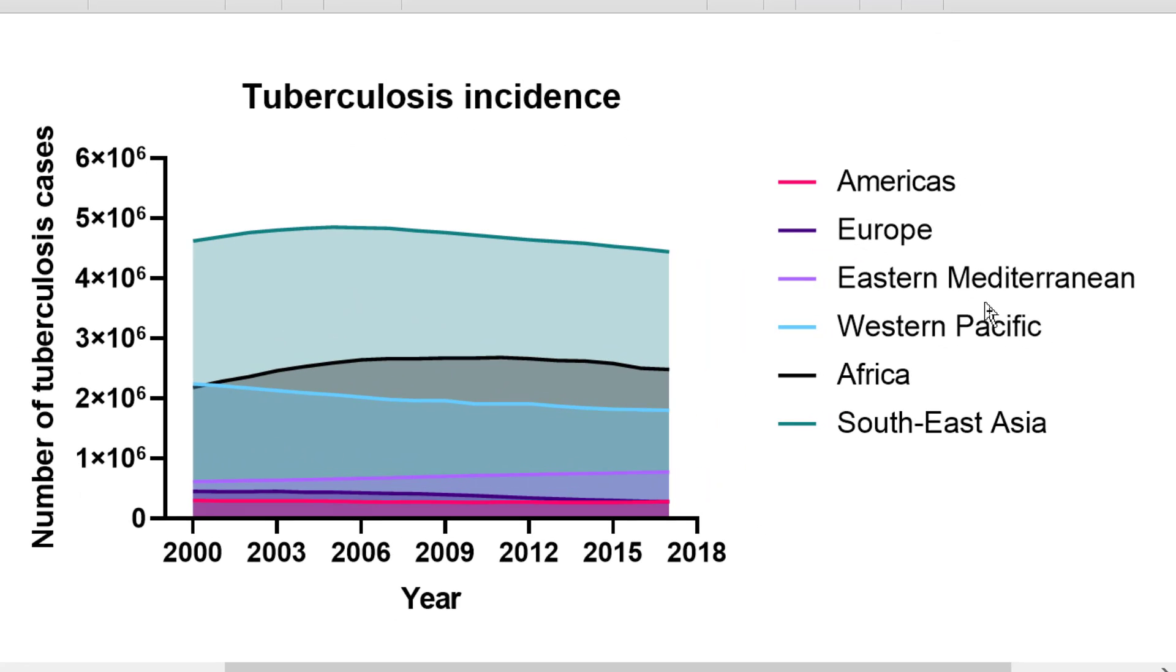So in this video tutorial, you've learnt about creating an area graph in PRISM. You understand that an area graph is a variation of the line graph where the area beneath the line is filled, usually with a color or a pattern. They are very useful to visualize trends over time, without the need to convey specific data values.